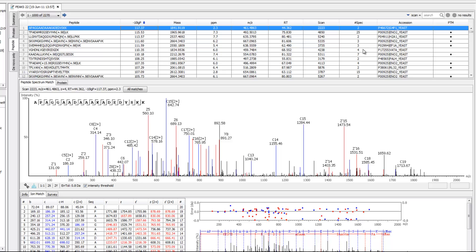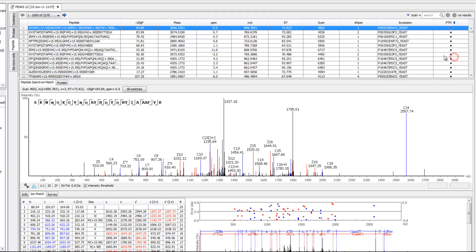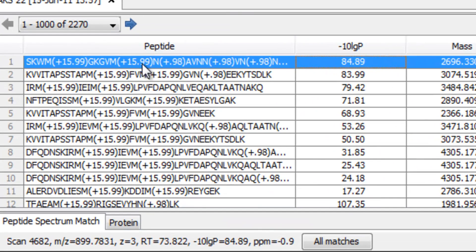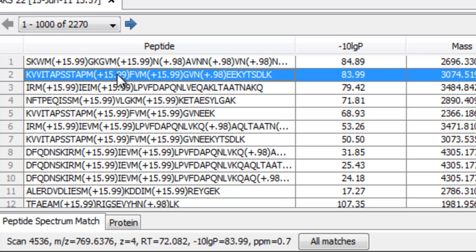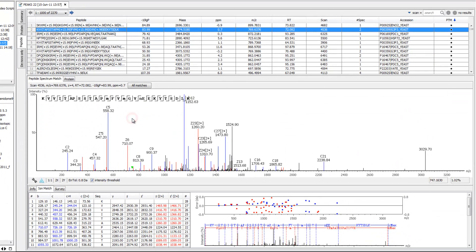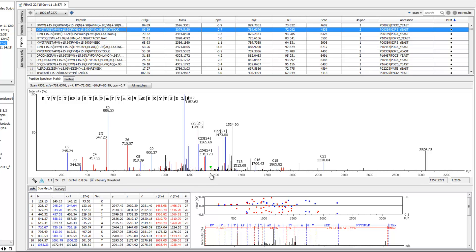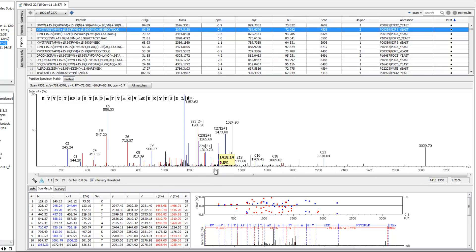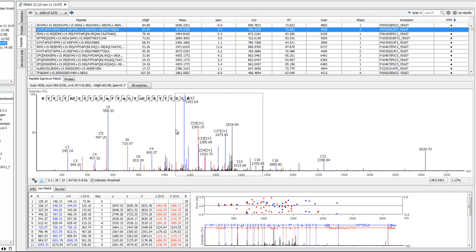Let's say I want to check a peptide that contains an oxidized methionine, which has a mass shift of 15.99 Daltons. Go to the peptide view, sort by the PTM type, and those peptides with the oxidized methionine will appear at the top of the list. Select an interesting peptide, and the spectrum annotation will appear at the bottom. You can conveniently zoom and navigate the spectrum by using your mouse wheel, or you may focus on a particular area by dragging the mouse and selecting a smaller area.